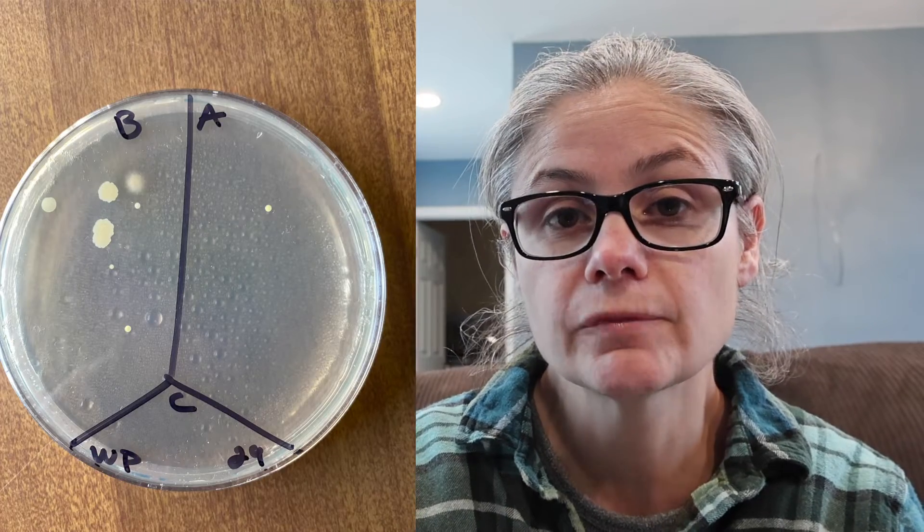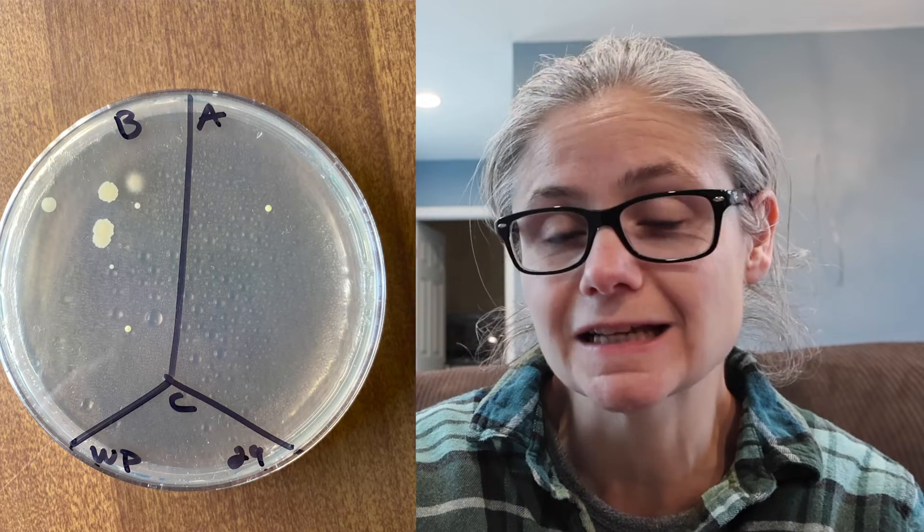The white throw pillow — in the before section there's about a dozen bacterial colonies, and in the after section it's decreased down to one. I also did the other side of the pillow as a double-check and it came up with the same result: about a dozen colonies on the before section and one on the after. So the Tide Antibacterial Fabric Spray does a good job at removing the bacteria from my white throw pillow.